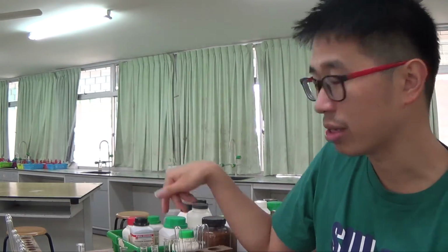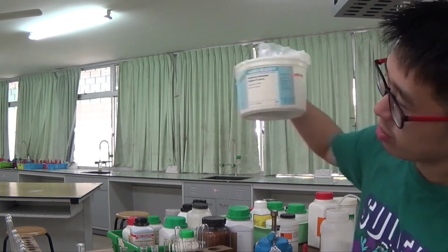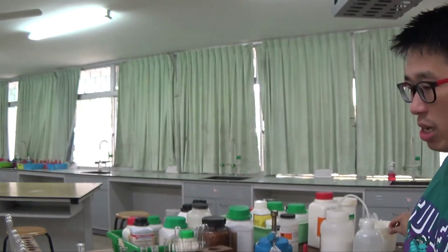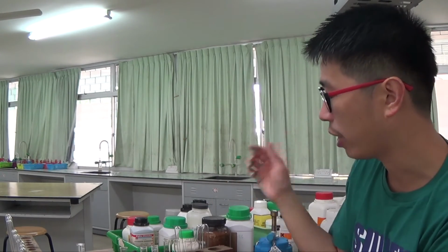Of course, you could also test for other anions because this is a mixed salt, but we knew originally it was ammonium aluminium sulfate. So the anion there is just sulfate. Okay, so the next bit will be testing for cations.